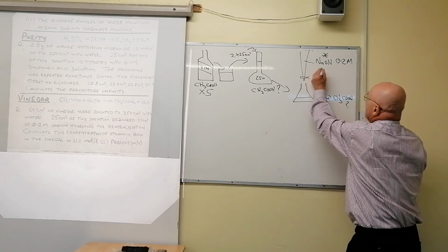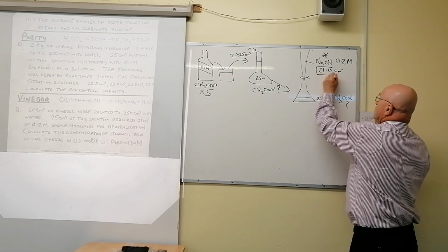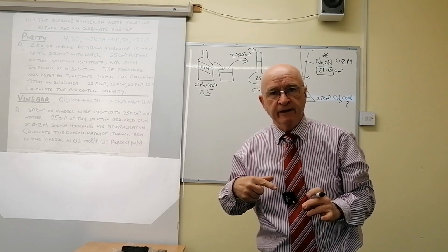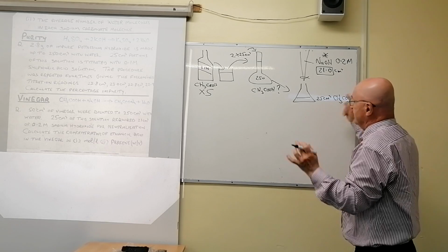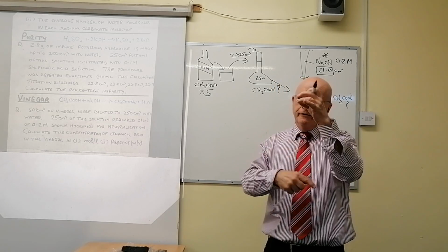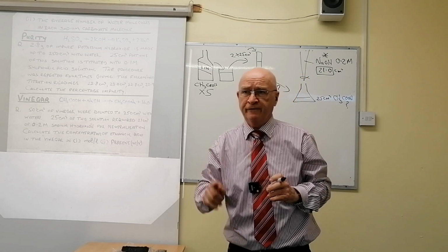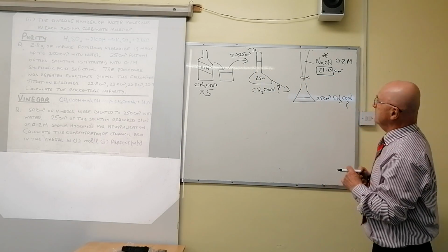21.0 centimeters cubed could only have come from a burette. A burette will give you any reading between 0 and 50 centimeters cubed. So that tells me that was upstairs and that was downstairs. Now, when I demonstrated this in the lab, I had them the other way around. I'll talk to you in a moment about indicators, even though there's another part of your course that deals with indicators, and that's the way it should remain.